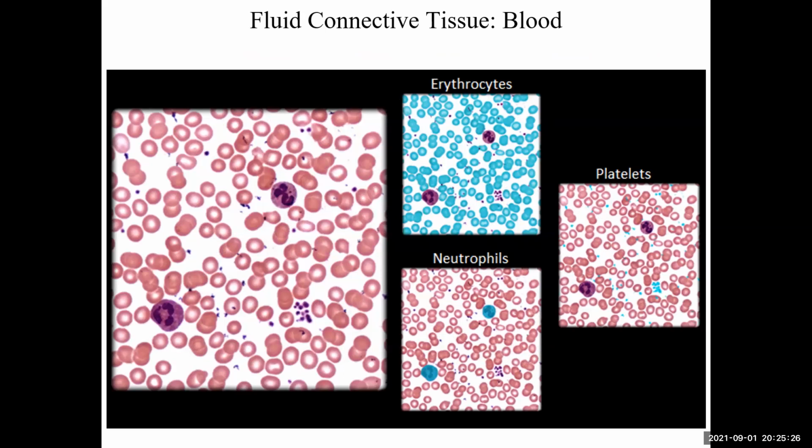Here is our fluid connective tissue right here. This is the last of the different types of connective tissue. This is a picture of our fluid connective tissue.